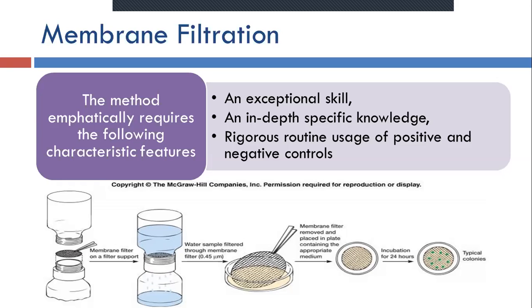The procedure is very simple. A previously sterilized membrane filtration unit is taken, and the membrane is inserted in the filtration unit. The substance or product is filtered either by using the negative pressure technique or the positive pressure technique. After it is filtered, the membrane filter used for this filtration is taken out and placed in the previously sterilized inoculation media, and then it is allowed to grow. The presence or absence of growth will give the positive or negative result of the sterility testing.